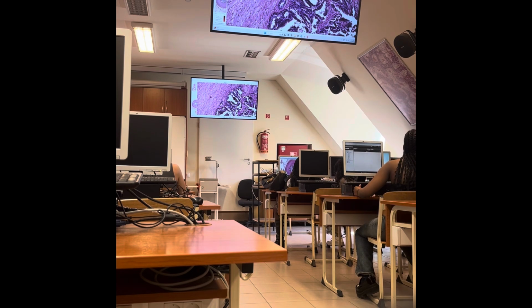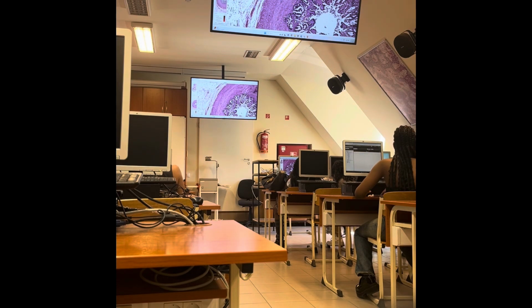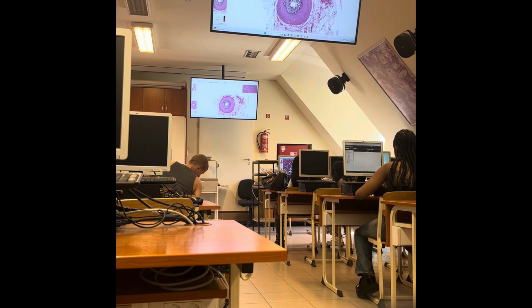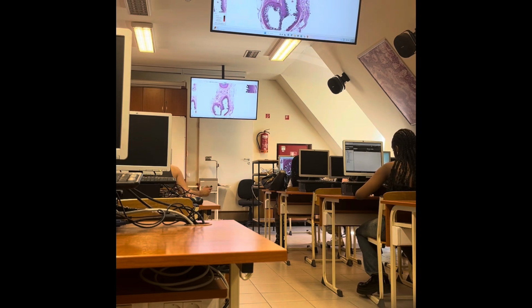That is gradually disappearing in this segment. So the muscle has 2 sublayers, inner circular and outer longitudinal sublayers. And beyond that we find the adventitia, the loose connective tissue layer. Okay, so this was the ductus deferens. Now let's see the seminal vesicle.